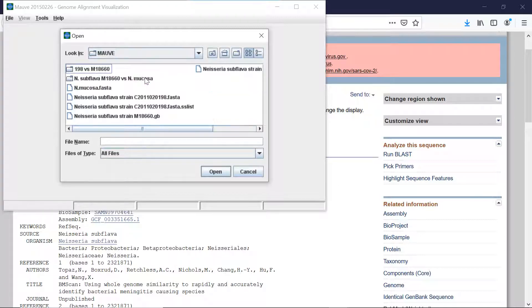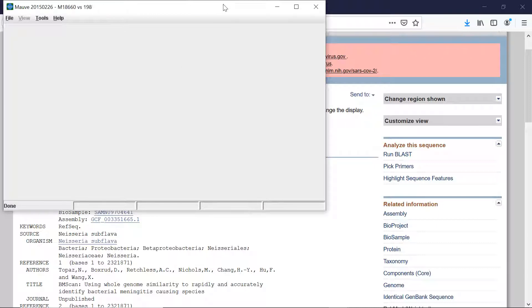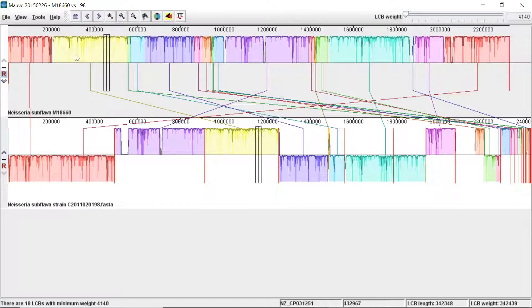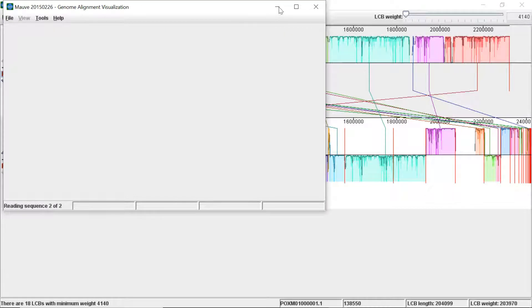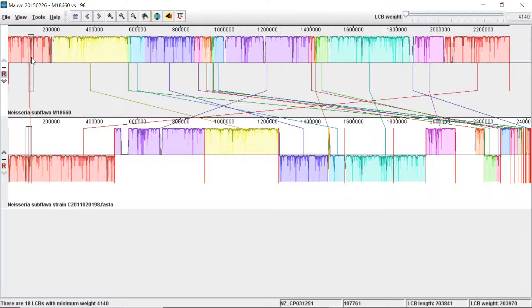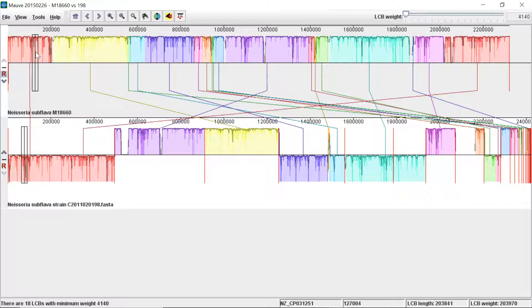Depending on how many genomes you're aligning, it can take different amounts of time. Once the alignment is complete, it will look something like this. Along the top you've got Neisseria subflava M18660 — that's your reference genome. Along the bottom is your query Neisseria subflava strain. As you move the cursor along, you can see it highlighting different parts of the lower genome. When the cursor moves in one direction along the top but the opposite direction along the bottom, it may depend on how it was sequenced — it might have sequenced the opposite strand, so it doesn't necessarily mean that piece is inverted.